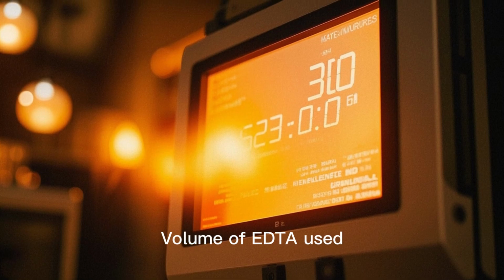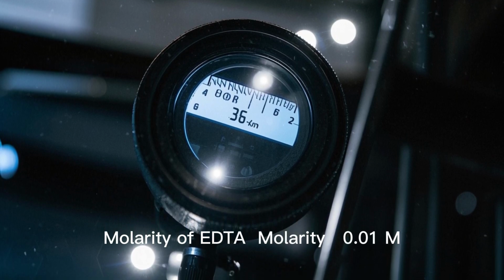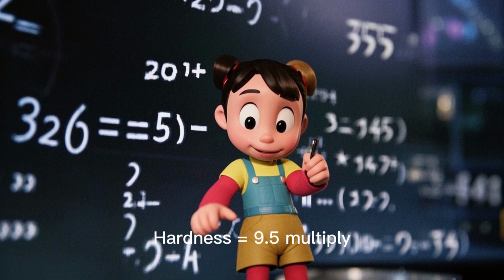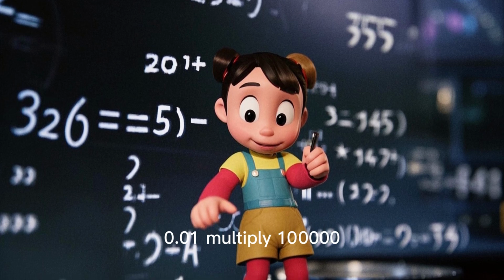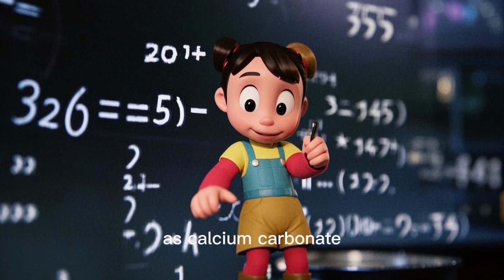Example: volume of EDTA used, 9.5 ml. Molarity of EDTA, 0.01 M. Volume of milk taken, 10 milliliters. Hardness equals 9.5 multiplied by 0.01 multiplied by 100,000, divided by 10, equals 950 milligrams per liter as calcium carbonate.